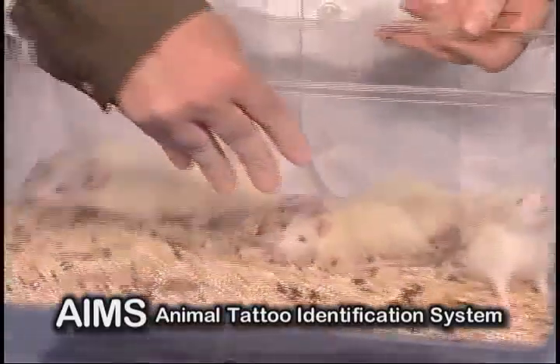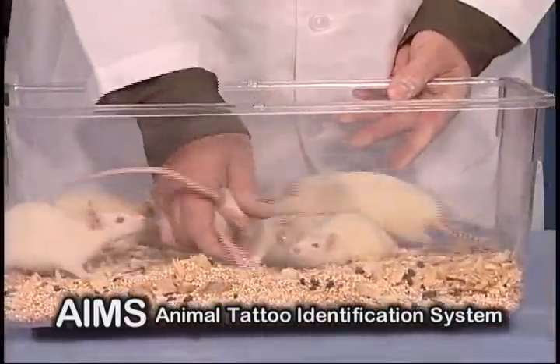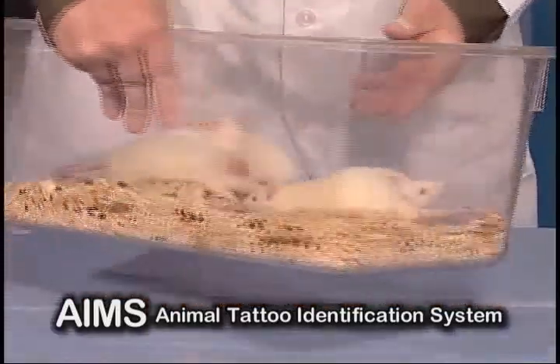In fact, you can even look through the side of the cage and see their tattoos — if we can get them to cooperate a little.